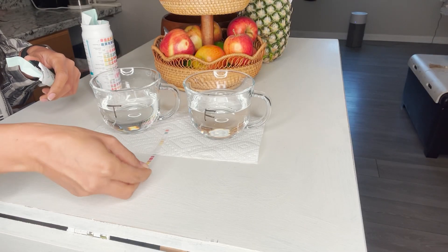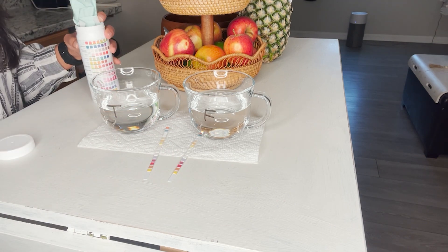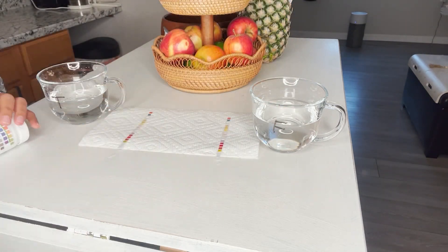Then we inserted the strips in the water for one or two seconds. Once that was done, we compared the charts with the strips, making sure that we were drinking high quality water.